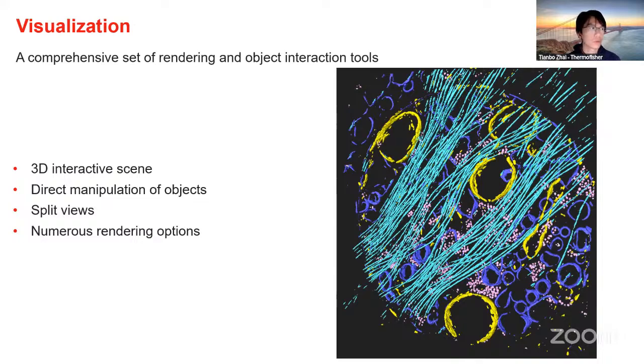By being able to visually distinguish early on what is the useful data versus what is just background, and then cropping away and trimming out that unnecessary data, you can improve the speed of your later analysis quite dramatically. In the software, you have the option to view the 2D slices, and you also have the option to understand what the 3D structure looks like.